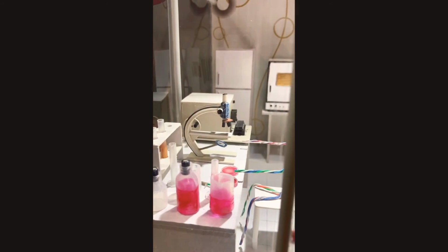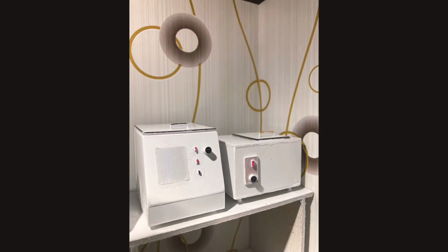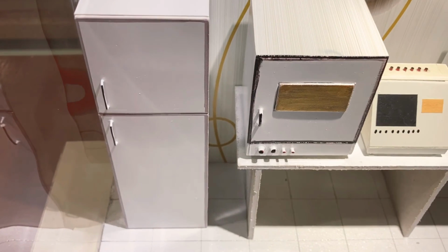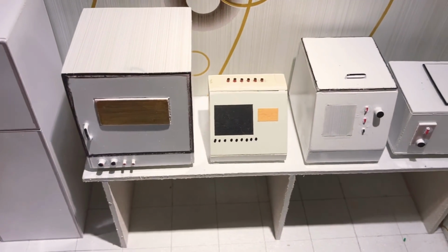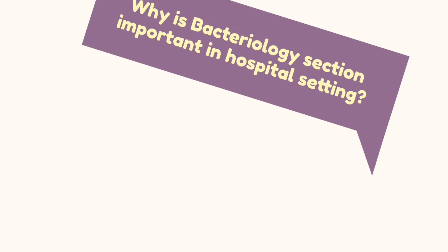Finally, when you get your blood drawn at the hospital, it must be separated, which is why the medtech must separate its components like the red blood cells, white blood cells, and platelets from the plasma for observation. The blood is placed in a tube inside of a centrifuge. As the blood spins, the heavier particles go to the bottom and the lighter particles go to the top.